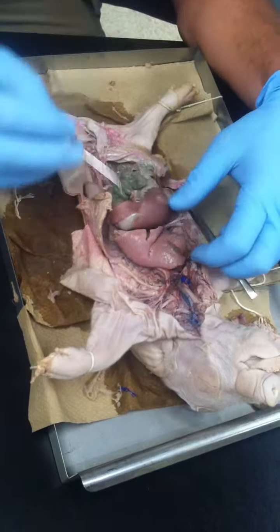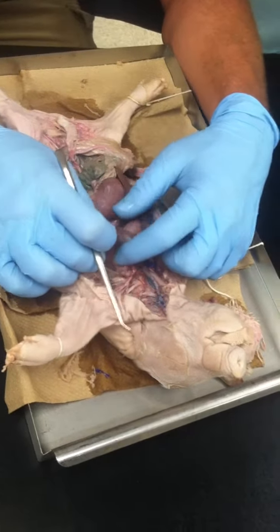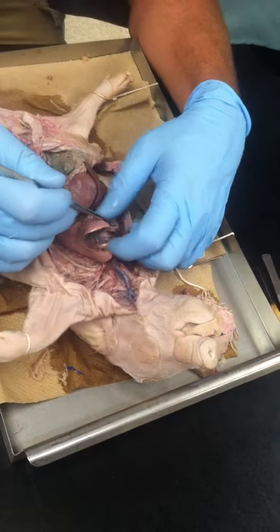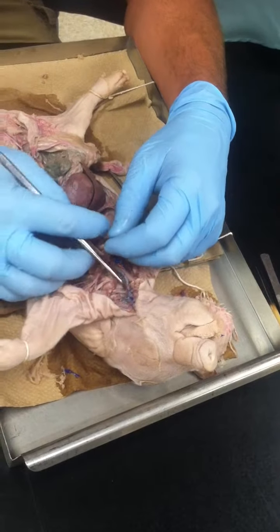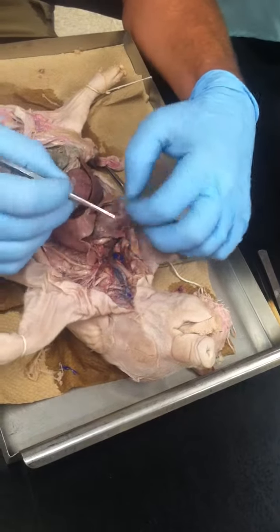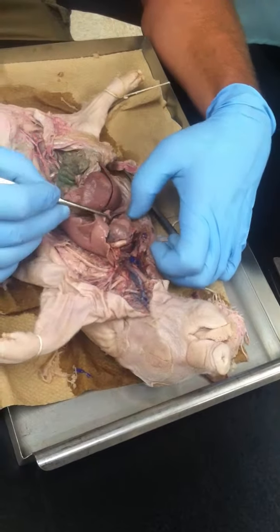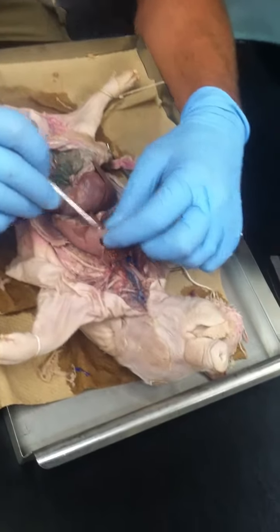Cardiac structures, back up to the heart. You have the sac, pericardial sac. We'll put that back on there. Oh, it's all wrinkly. Spun around. Pericardial sac. There's your sac. I'll take that off of there.